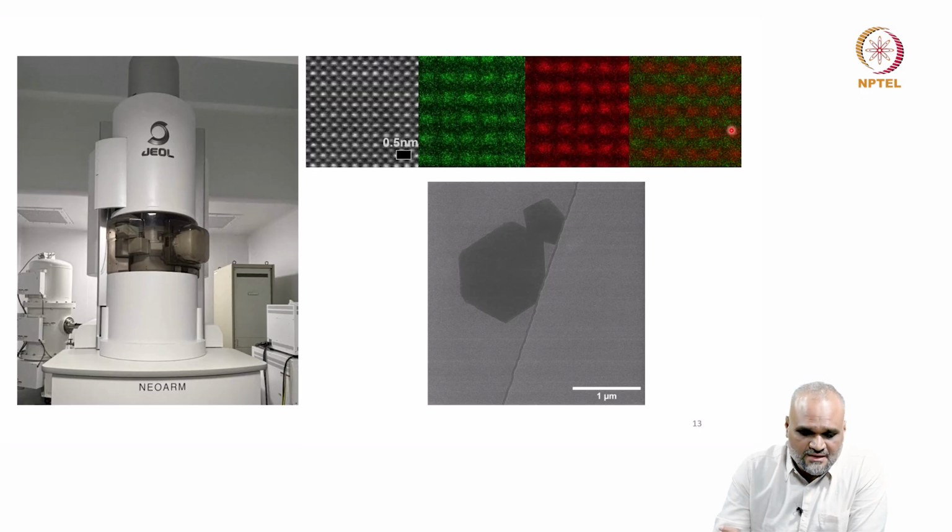So to summarize, transmission electron microscopy started as a technique where you can get information from materials down to a few angstrom level, and we've broken the angstrom barrier, and now microscopes have evolved into tools where you can do manipulation of matter, real-time changes to the material, and get complementary information, which makes it an extremely powerful technique.